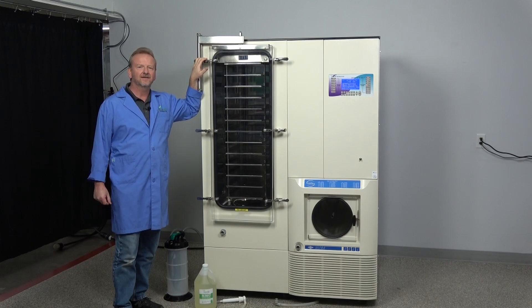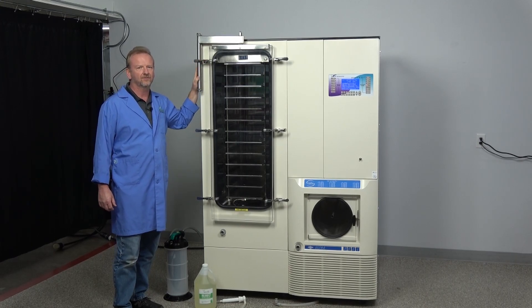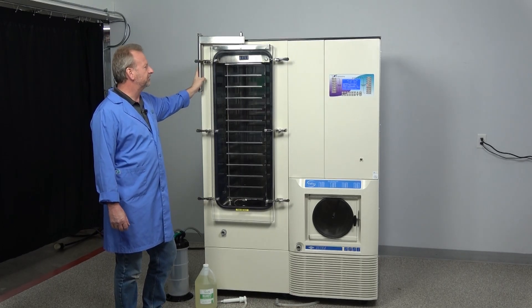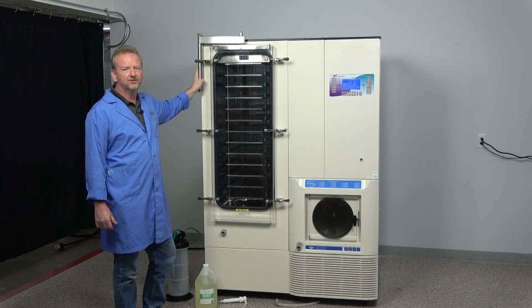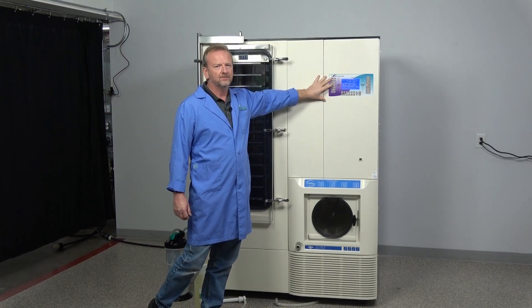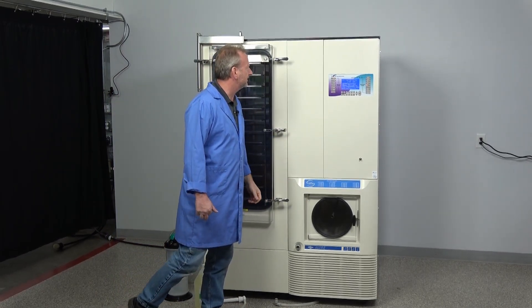Hi, I'm Rich at New Life Scientific and I'm here to show off our newly refurbished Virtus Ultra. What we've done on this machine is we've upgraded it to the new control system with the Wizard 2.0 driver user-friendly screen.